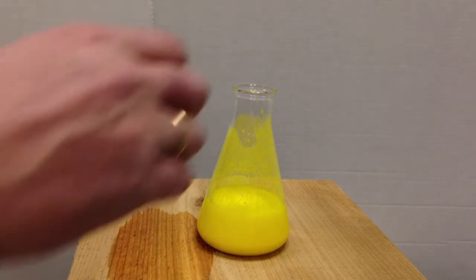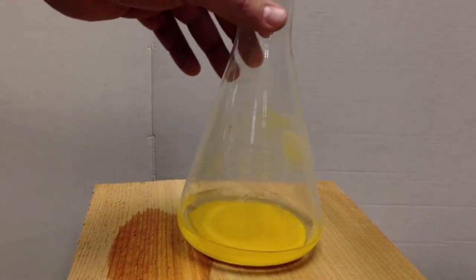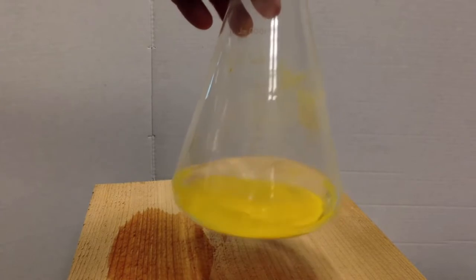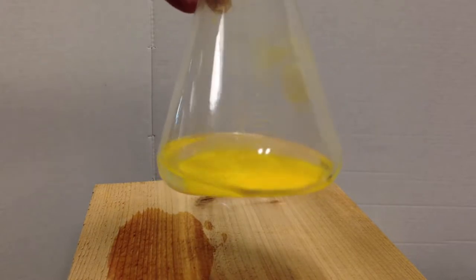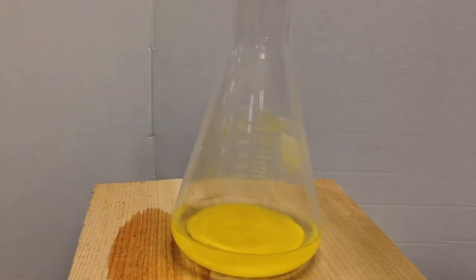This is a reaction I did about an hour or so ago, and you can see here that the clear solution is the potassium and nitrate ions, and the solids are at the bottom. That's settled at the bottom. All right? So there is your precipitating reaction.